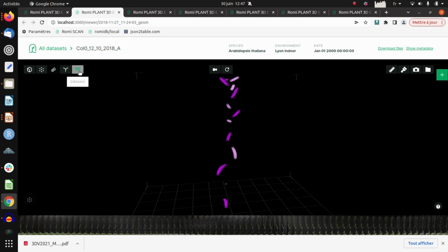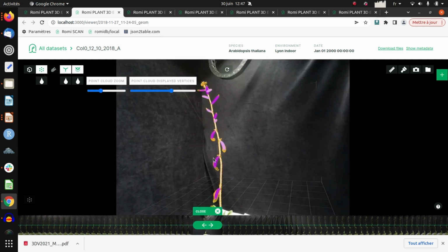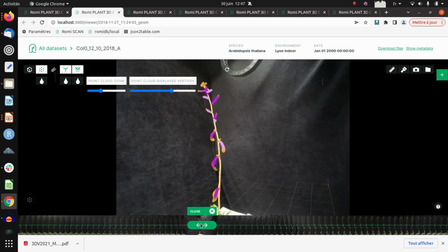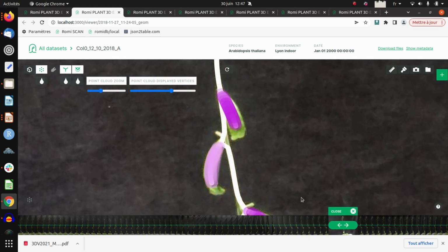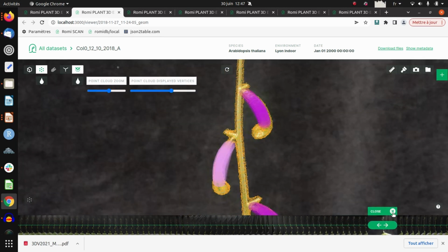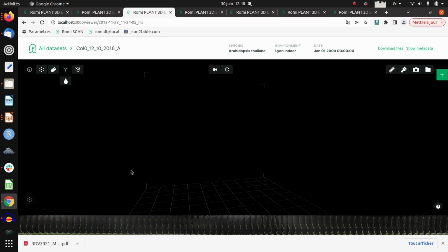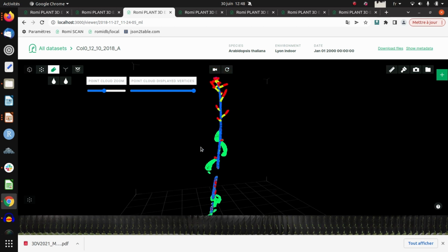Finally, we also develop a web app to gather and inspect all the results of your analysis. This interface, called the Plant 3D Explorer, allows to visualize all 3D objects that have been generated by the analysis, to display them as independent layers, and to check visually how they fit with the original 2D images acquired by the Plant Imager. The available content for display automatically adapts to the type of analysis that was performed. This tool is used both by developers to evaluate the performance of the 3D analysis of their tools, and for biologists to get the results of their phenotyping experiment.